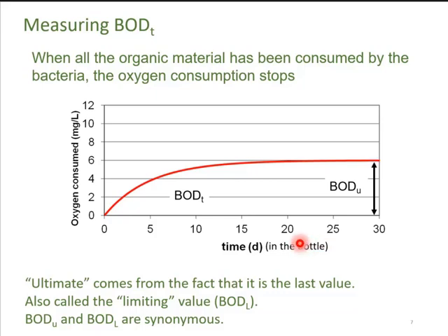Now in practice, we don't want to wait 20 to 30 days to get this value, and so we typically measure BOD5. That's the standard time. In this class, we're going to measure a BOD7 for convenience.